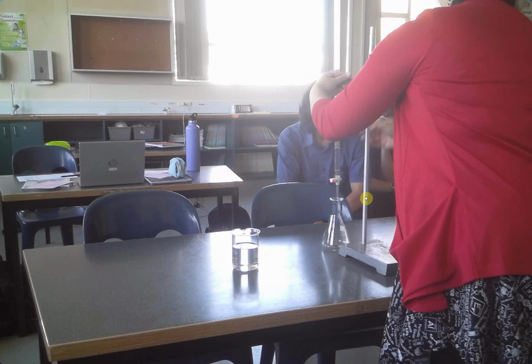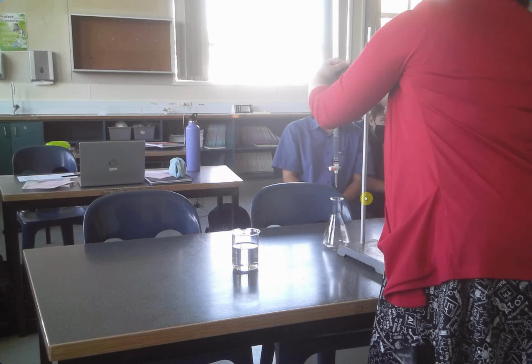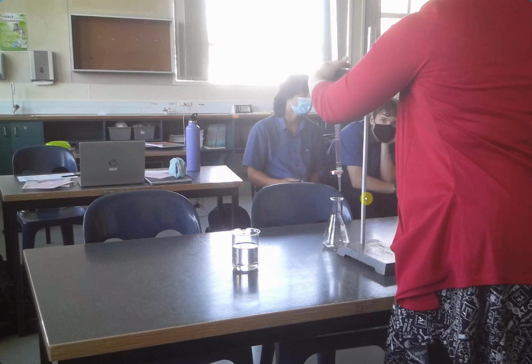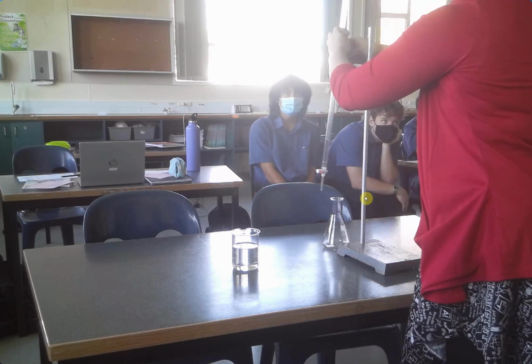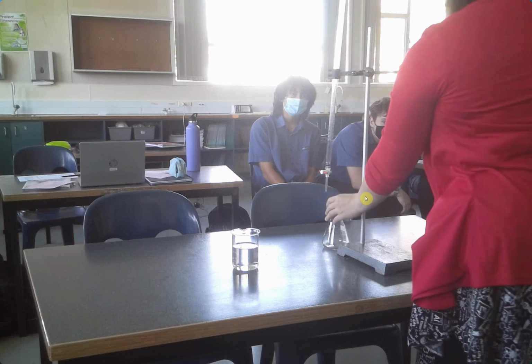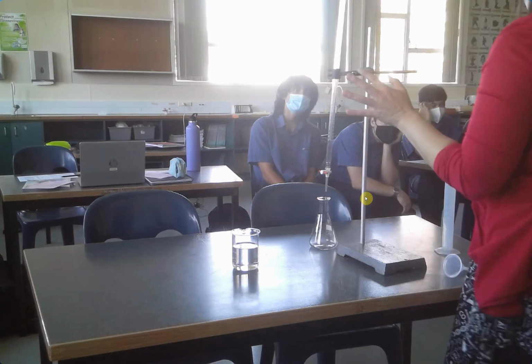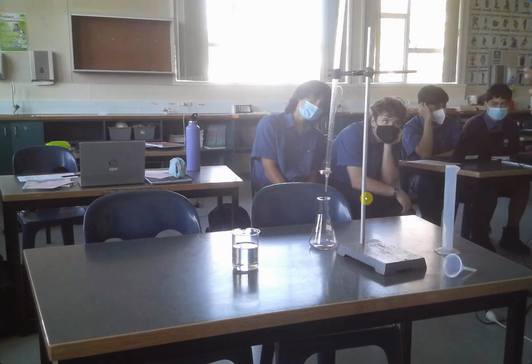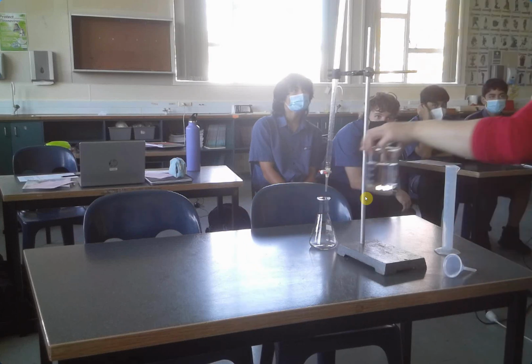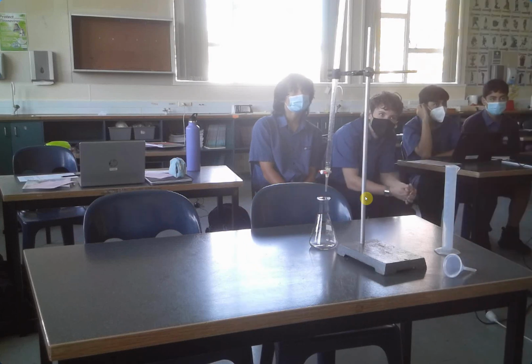The thing you have to remember with this equipment is that because we are doing titration, we're trying to accurately measure concentration. Something really important is that you have separate equipment from the normal classroom stuff. That's to keep it clean, so you don't have any cross-contamination. The other really important thing is that we're using something called distilled water. Have you guys heard of distilled water? Yeah, it's water that's distilled. That's a good start.